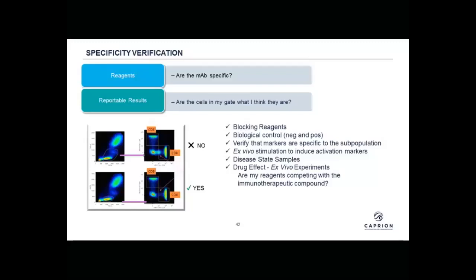So we've included lymphocytes and monocytes. And then when we look to the plot to the right, we want to look at our CD4 T cells, and we can see them. We also see another population in that gate, which are not T cells, they're in fact monocytes. So they're dim CD4. So this gating is not specific.